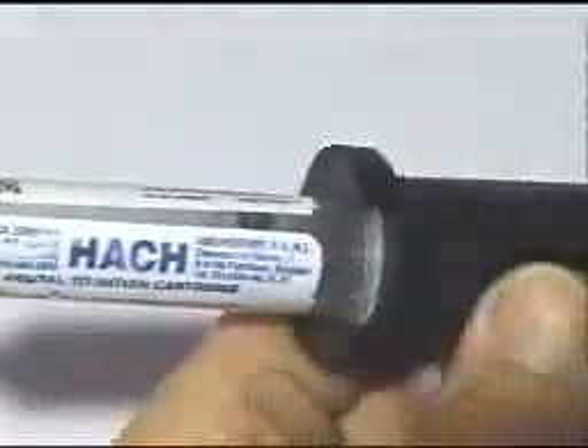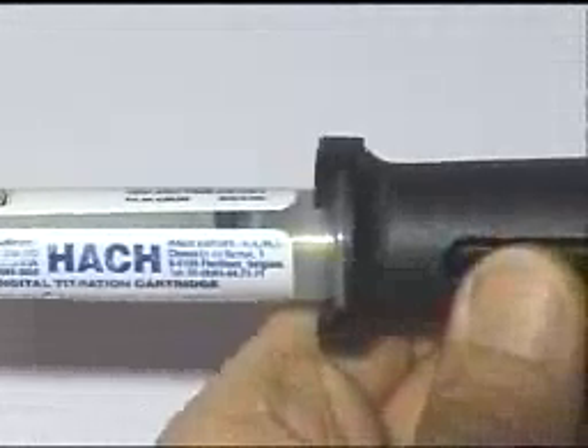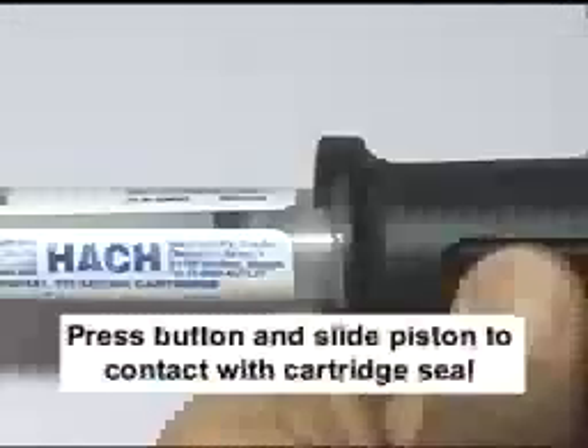The cartridge must be inserted completely. Twist the cartridge slightly to lock. Press the button and slide the piston to make contact with the cartridge seal.